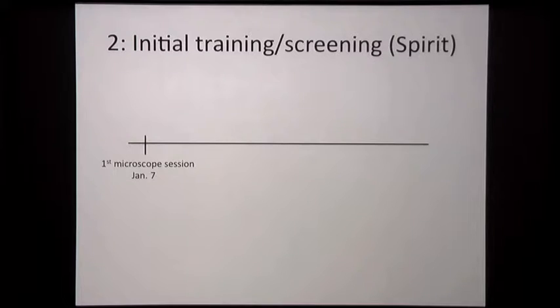So with a sample in hand, I had my first microscope session with Christos in early January. As Christos explained, the first several sessions on the microscope are just learning how to operate it. I like to refer to this as the how-not-to-break-the-microscope phase of training, which is very important because people get very angry when you break the microscopes.